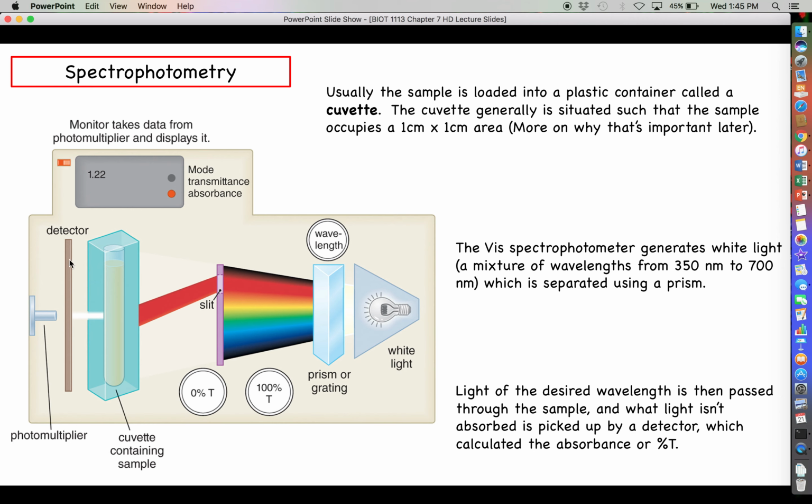So if you look at the absorption spectra for the two different types of chlorophyll here, which are a little bit different, you'll notice that they do a pretty good job of absorbing light between 400 and 500, those are the blue colors, and also between 600 and 700, those are the orange and the red colors. However, light is not getting absorbed between 500 and 600. Well, guess what color that corresponds to between 500 and 600? Yep, it's going to be a lot of green in there.